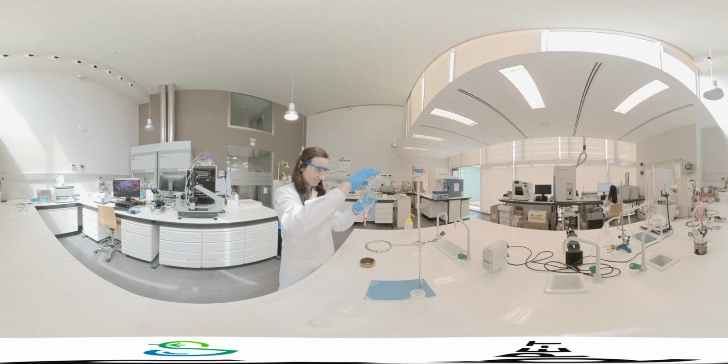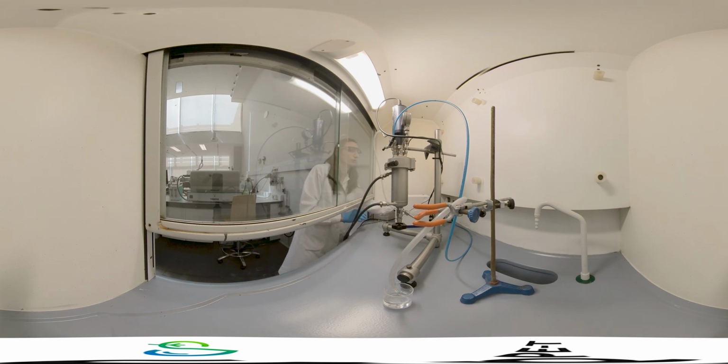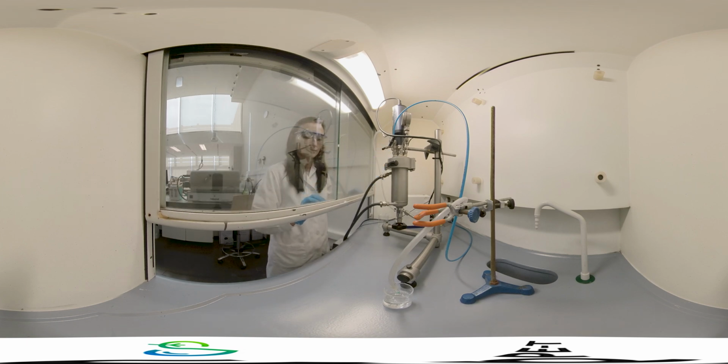Because the following reaction intermediate is a gas product, the reaction is carried out in a stainless steel reactor that withstands high pressures. A small fraction of this gas product is dissolved in methanol to be characterized by gas chromatography.